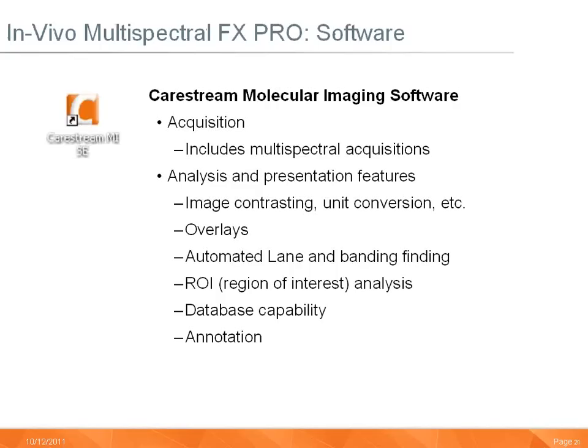The In-Vivo Multispectral FX PRO is operated via the Carestream molecular imaging software. All acquisitions, including multispectral fluorescent acquisitions, are performed here. The MI analysis has multiple integrated analysis features for both in vivo and in vitro applications. The navigation panel in the software allows for contrasting, unit conversions, overlays, auto lane and band finding, ROI or region of interest analysis, databasing, and annotation.